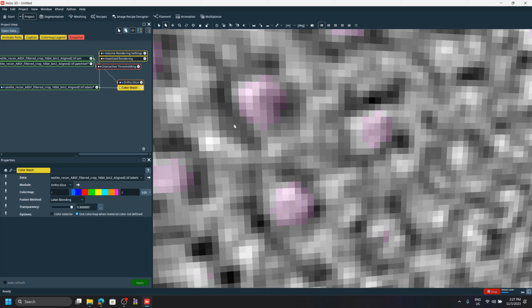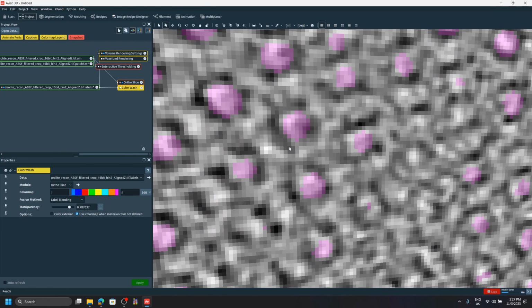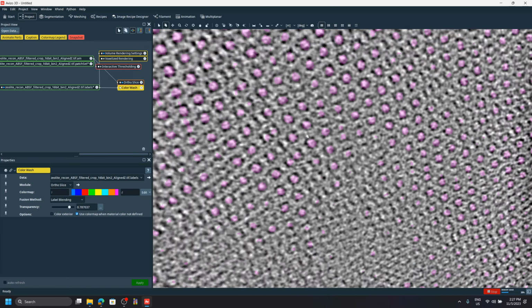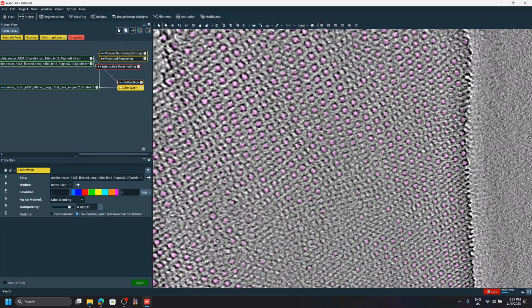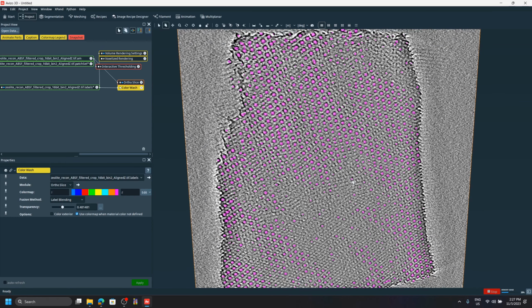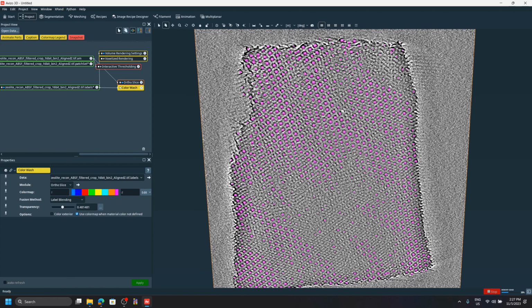Around that. Of course, it's going to vary. For this data set, I don't know, actually. It's nano. These guys work on the nano scale.